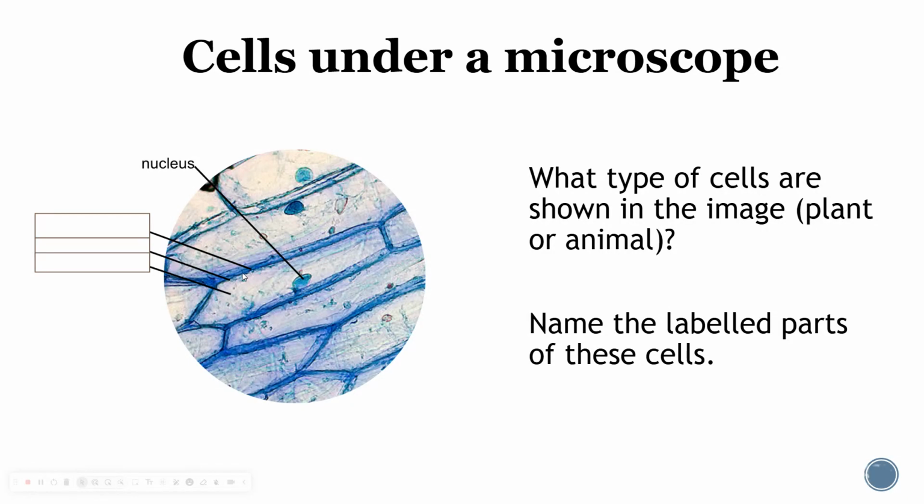Over here and over here you have arrows pointing at spots that are very similar. This is the outside spot, that's the inner part there. So the outside spot is probably the cell wall, and the inner part there is probably the cell membrane. And over here, this is a bit tricky. You'll see it says vacuole. It's very hard to see, but there's a central vacuole here. I would probably label that as cytoplasm, because you can barely see the vacuole in this image here. So if you said cytoplasm, that would have been correct as well.